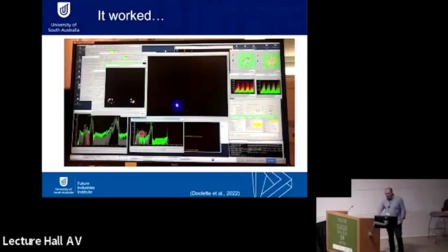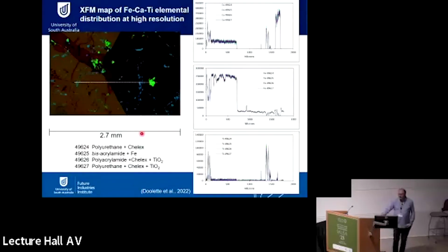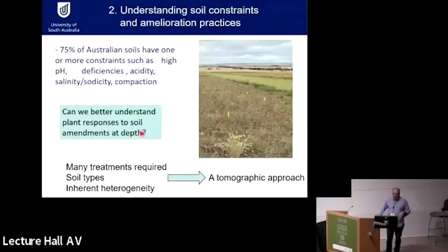And so, we have also proven that there is no deterioration in the signal. So this is the downstream sample, and you can see that independently of whether you have a gel or not, you get the same kind of information. And we use Siemens stars as well to look at the deterioration in the resolution, and you really don't have anything that is significant. So in this way, we can actually do the analysis for free. We can run an experiment downstream and at the same time scan our gels upstream.